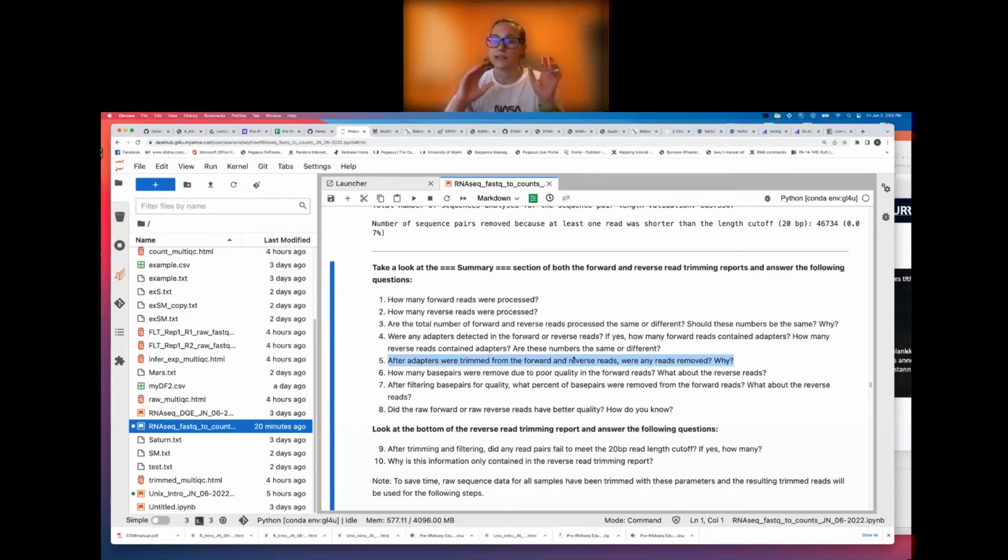So it needs to wait and do the quality trimming on all the forward, do the trimming on all the reverse. And then once the trimming is done for the forward and done for the reverse, then it looks at the forward reads and its respective reverse read. And if either one of those is less than 20 base pairs, it'll remove that read. So we kind of really harped on that. So unless someone wants further explanation, maybe we could just move on to this one, Armin.